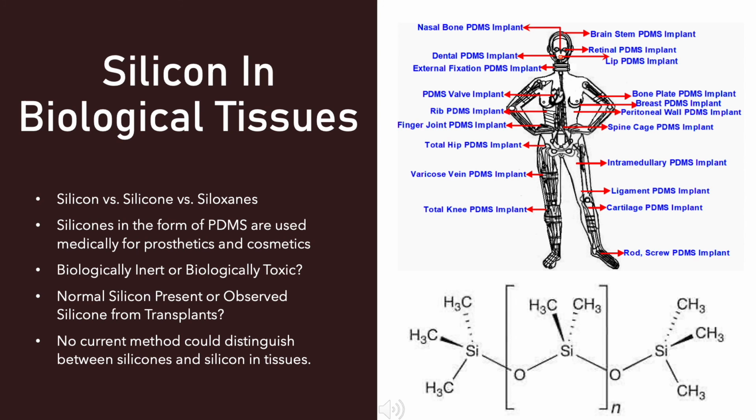Silicone is a man-made polymer that is derived from the natural chemical element of silicon. Siloxanes are functional groups with alternating oxygen-silicon backbones. These are what are found in silicone. Silicone is the makeup of PDMS. PDMS was first synthesized in 1950.